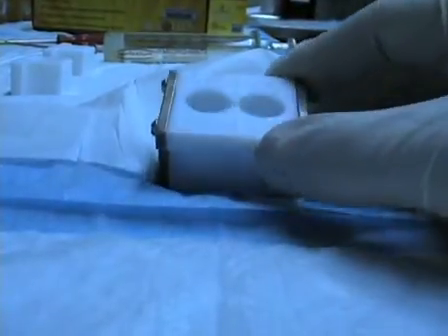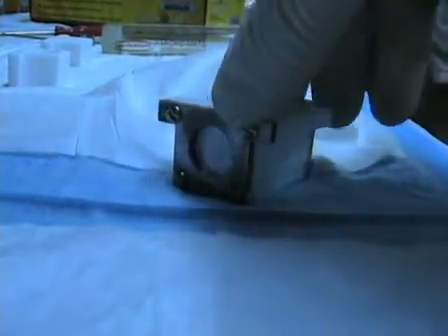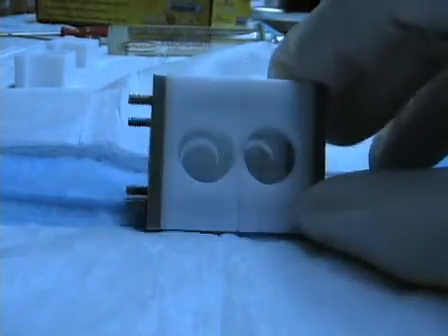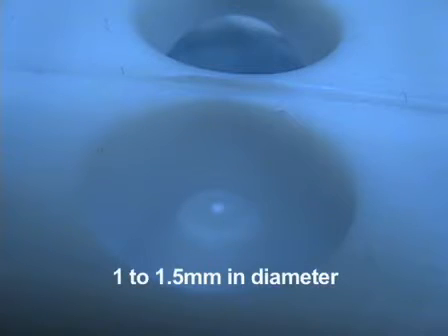Next, we will prepare the chamber where the experiments are performed. The chamber is divided into two halves by a septum, which is made of a thin Teflon sheet about 100 microns thick and filled with an electrolyte solution. We form the bilayer across the hole in the septum, which provides connection between the electrolyte solutions. The hole should have a diameter of 1 to 1.5 mm.